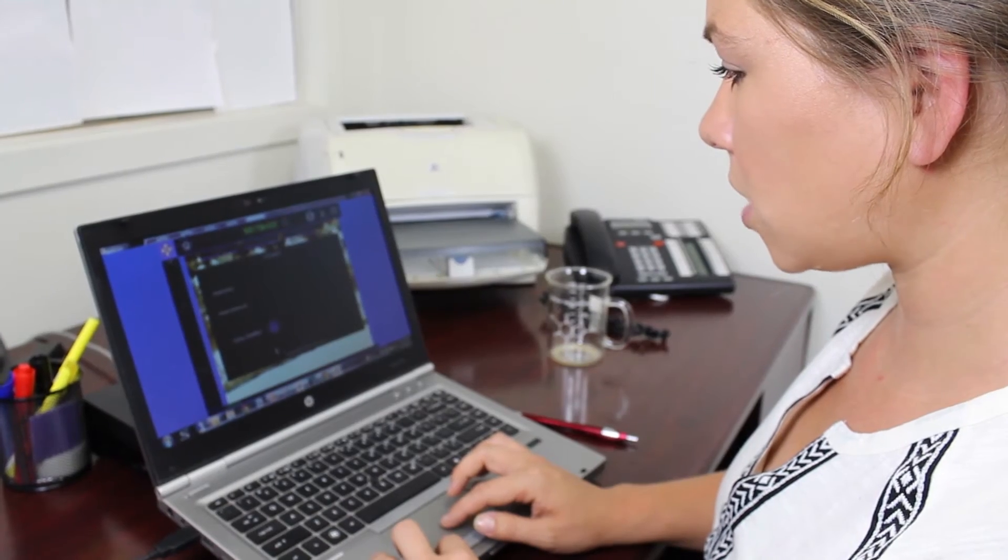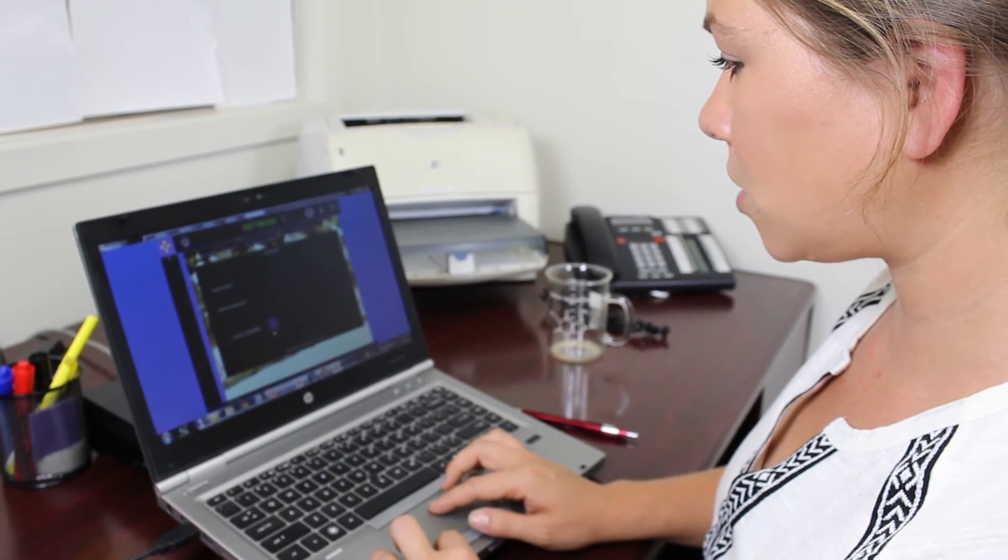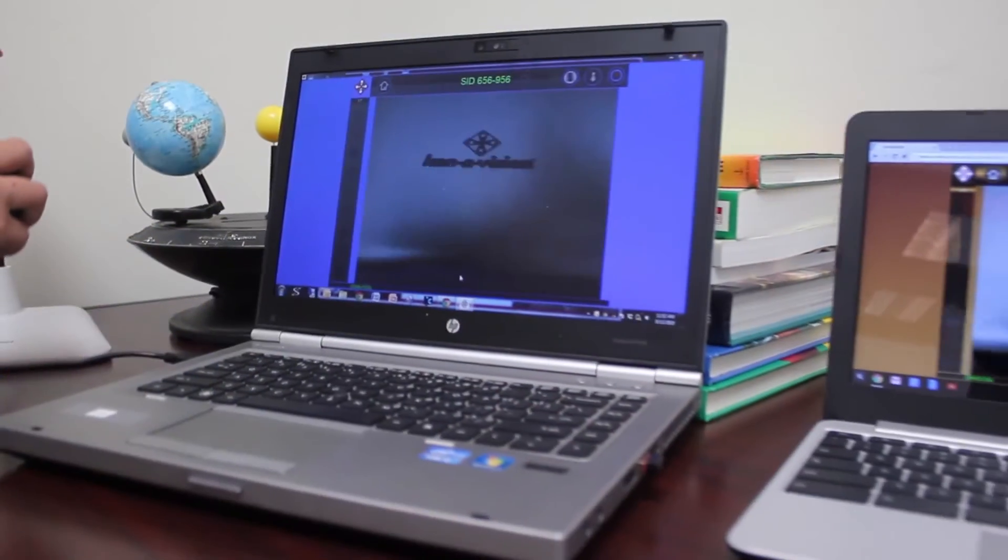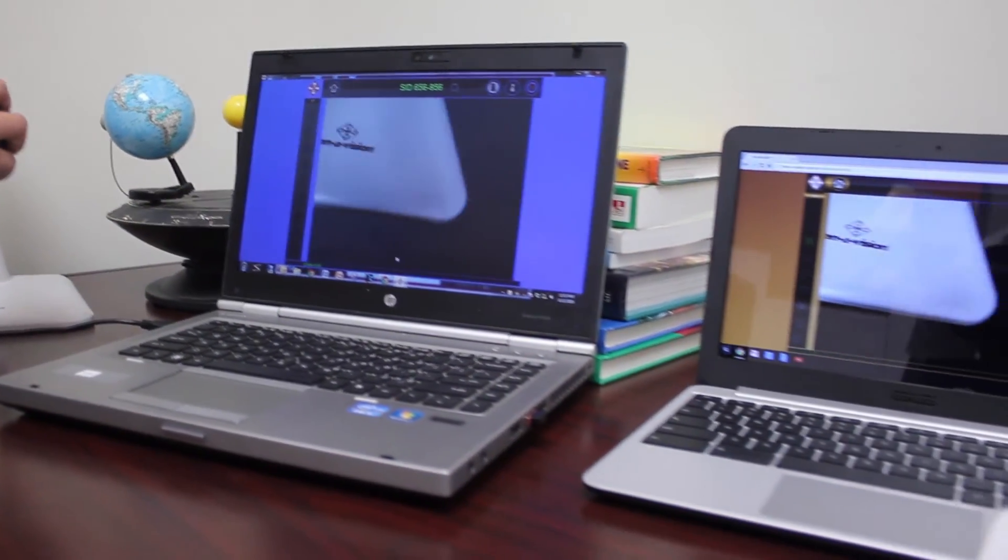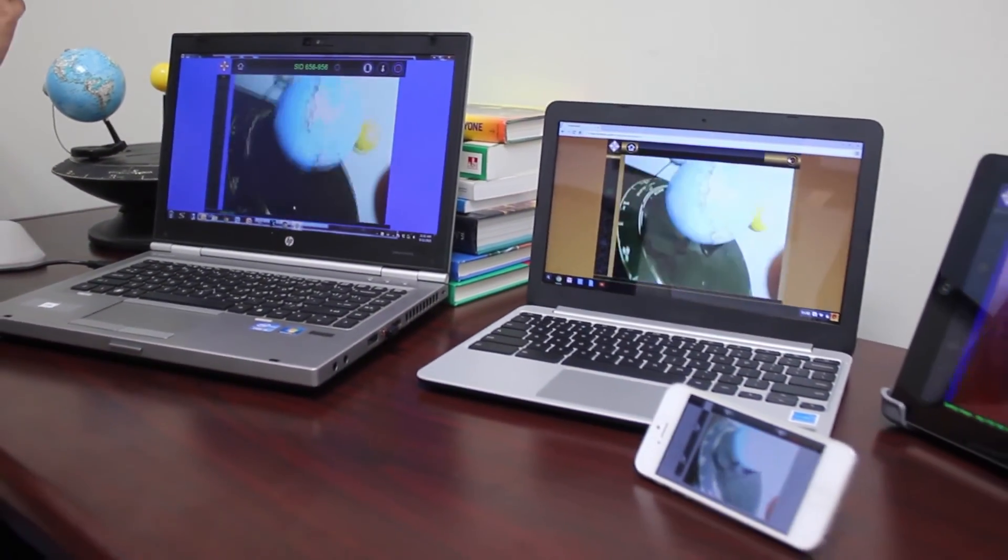With a click of a button I'm able to share with up to 40 students on any type of device.